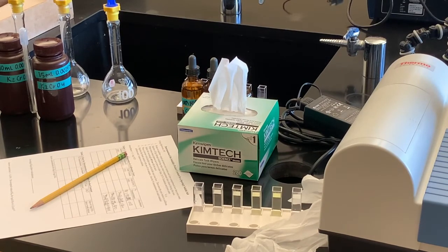The percent transmittance for the 15 milliliter solution is 31.6%. Once you have all these readings you can construct a calibration curve. For the calibration curve you're going to plot absorbance versus concentration. We used the Spec 20 to get all our percent T values, then you calculate the absorbance from percent T, and plot concentration versus absorbance. You'll fit that plot with a line of best fit — that is your calibration curve. It's actually going to be a straight line, and you'll use it to determine the concentration of unknown solutions.